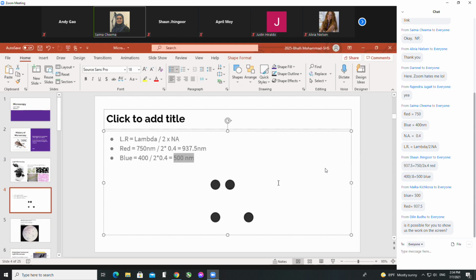Okay, so power of resolution is a function of two things: the wavelength of light that we're using to illuminate the specimen, and two, the numerical aperture, which refers to the quality of the objective lens and how well it captures light that strikes it. The more it captures, the higher the numerical aperture. The more light is reflected and the less is allowed to enter, the lower the numerical aperture. So you can't control numerical aperture. You can just swing in a different objective lens with a better numerical aperture, right?